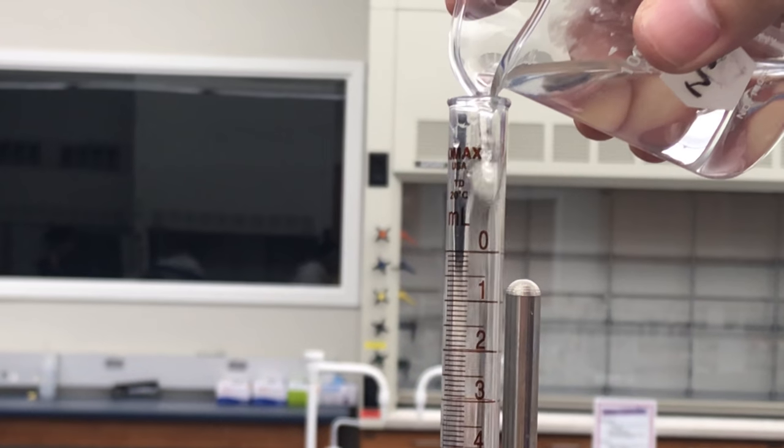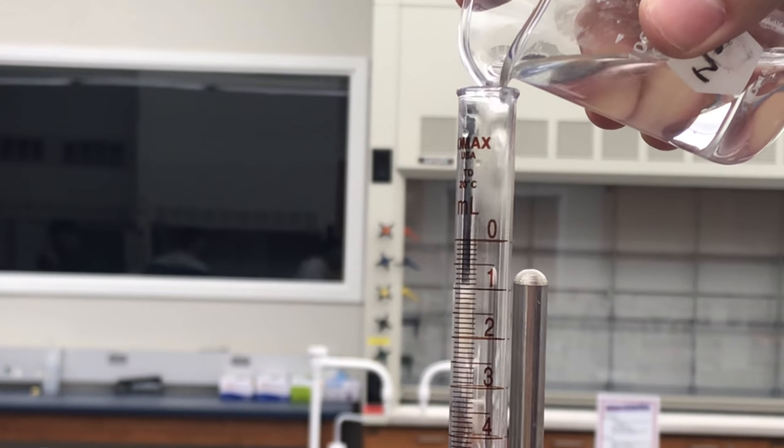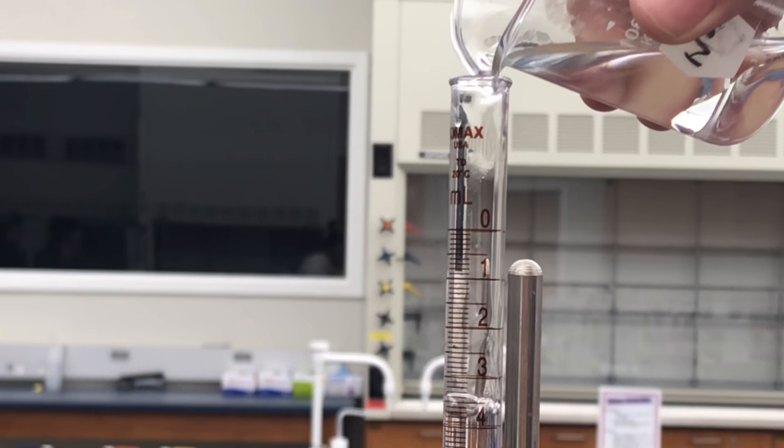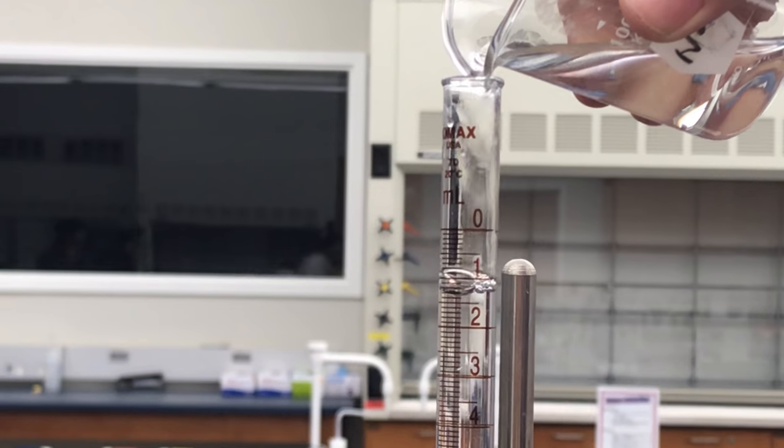Pour a bit of the known solution into a waste beaker to eliminate excess air in the tip of the burette. Record the initial volume of the known solution.